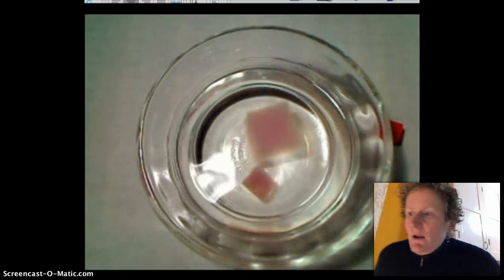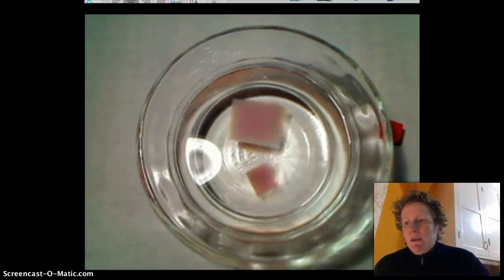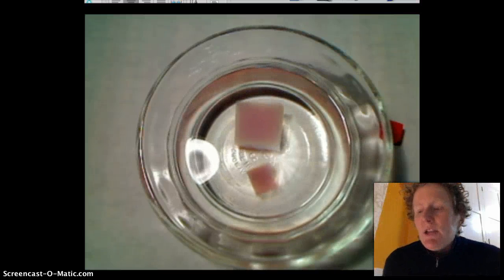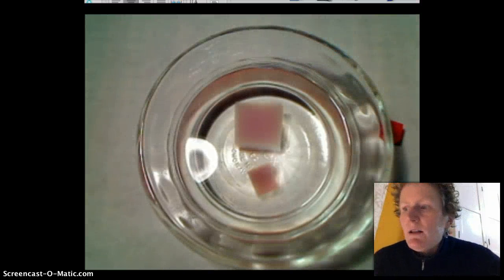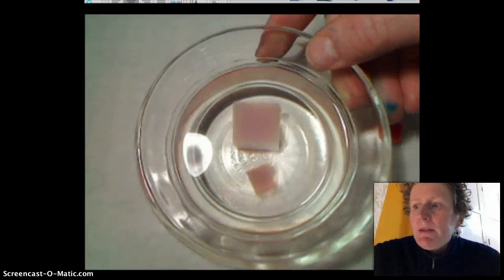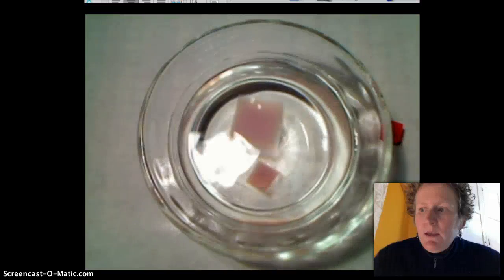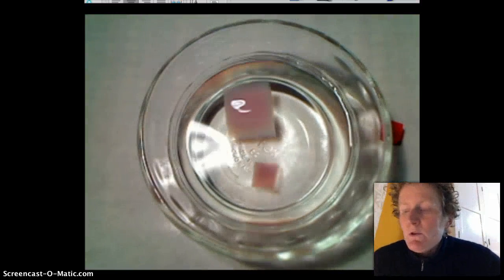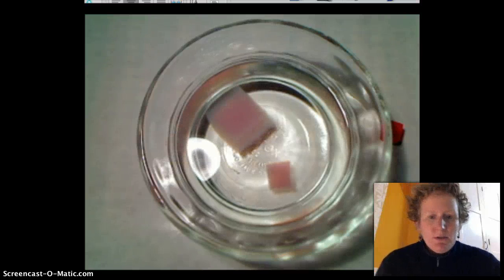What gives the agar its pink color is phenolphthalein and that phenolphthalein changes color as it hits an acid. It's pink in base and turns colorless in acid and vinegar is going to turn those cubes white on the outside edges as the vinegar diffuses in.